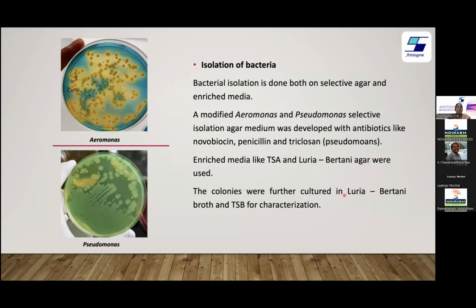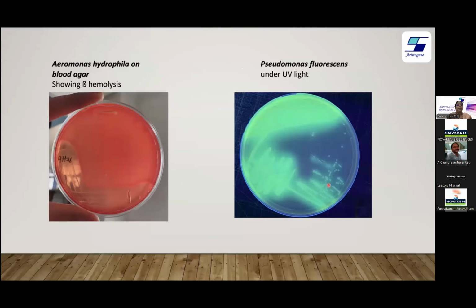And also when we are plating this, you need to see that you plate an appropriate dilution of the sample so that you get single isolated colonies. This also has to be standardized by your repeated trial and error, so you know at what dilution you will get a single type of colonies. This is also one of the steps. This could be discussed a little later also, but anyway.